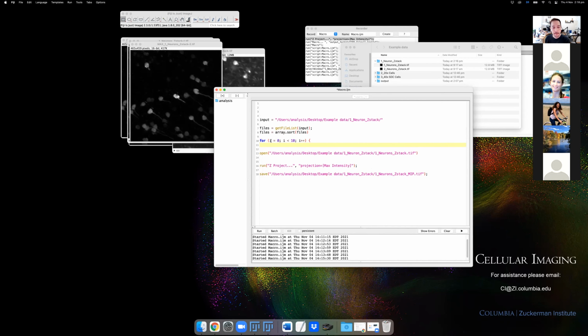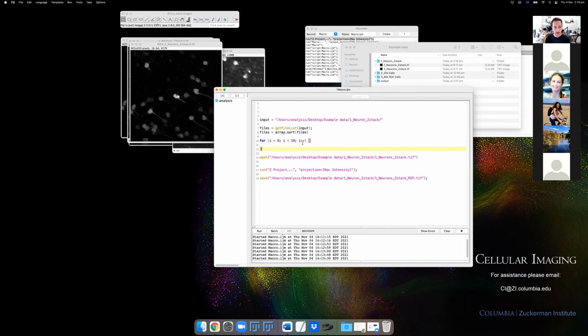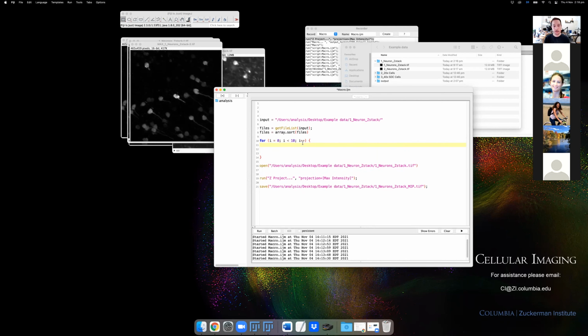So what this is saying is we're looping through from 0 to 9. We're starting at 0 and running through this loop here. I'll just close the loop. Everything that's in here, we'll go through for 0, then we'll go through for 1, all the way up until we get to 9, because this is saying everything less than 10.